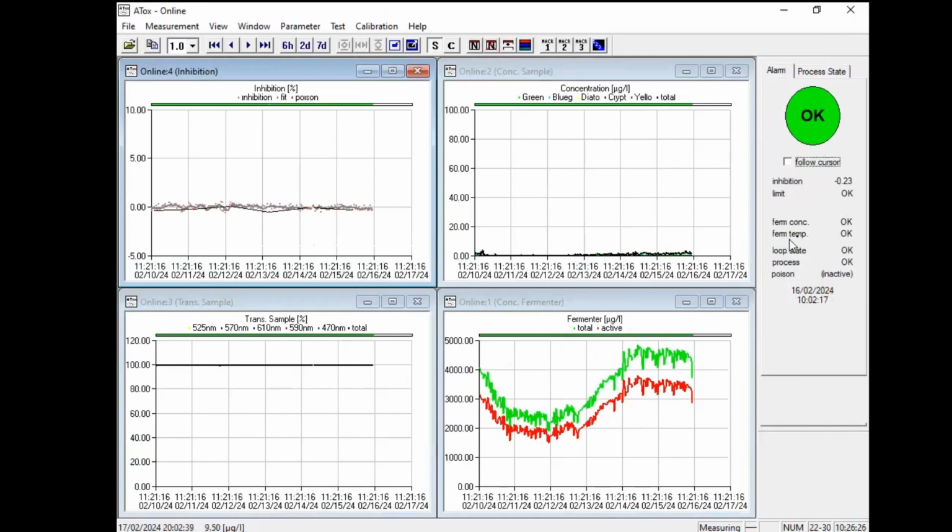So this is the process you see, and this is a display which you only get if you use this software at the instrument. I say this because you can use the software also on your desktop computer, but then you have no hardware and no process which is ongoing. Here on the bottom, you see the system is measuring, and there you see, for example, the serial number of the chlorophyll sensor which is built in.